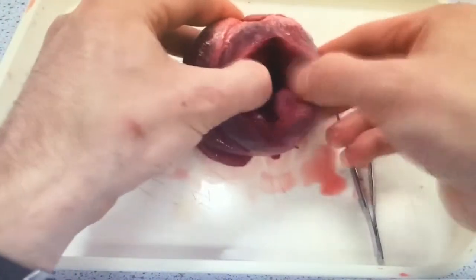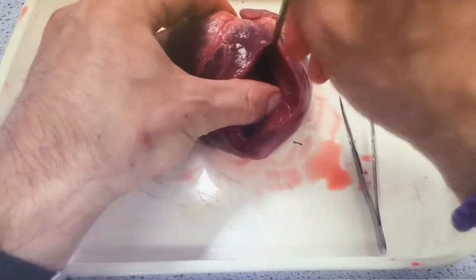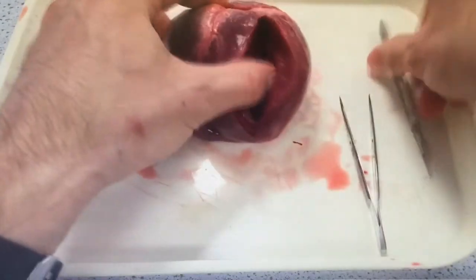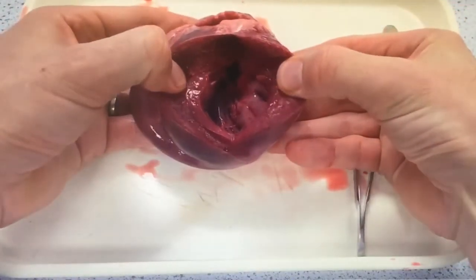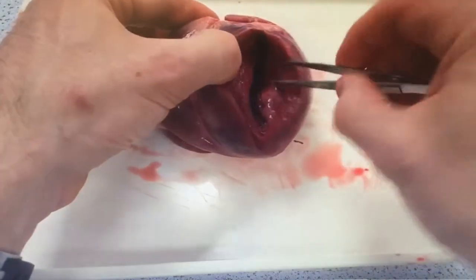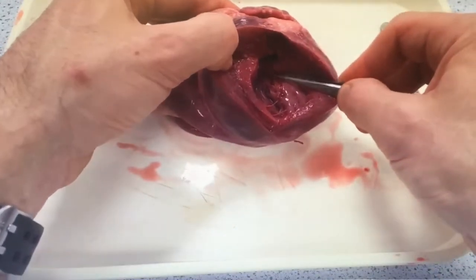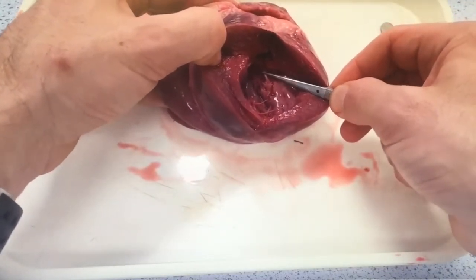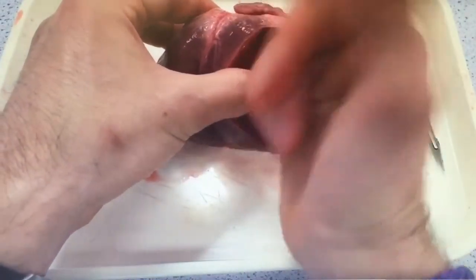As we move through this dissection we get some really excellent shots. Here you can see the thickness of that muscle wall of the left ventricle. It's truly quite thick, and it also begins to expose some of the chordae tendineae that hold the valve in place — preventing the valve blowing back on itself when the ventricle contracts, creating high pressure and preventing backflow of blood into the atria.